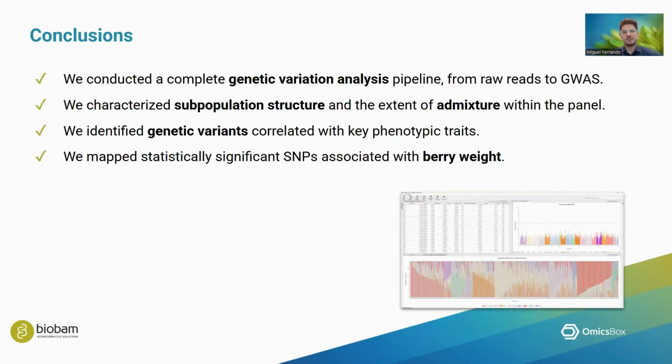As conclusions of this webinar, we successfully conducted a genetic variation analysis pipeline from raw reads to GWAS. We characterized subpopulations and the percentage of admixture within this panel.